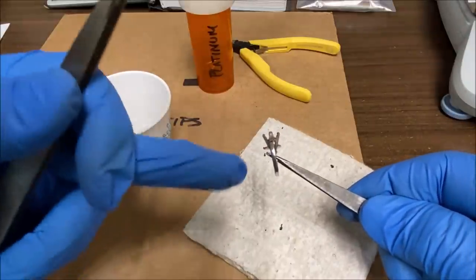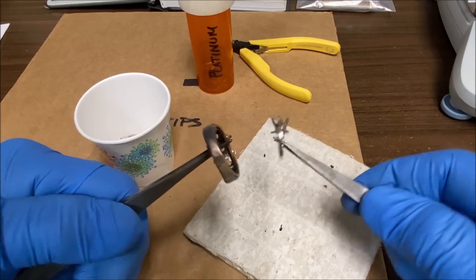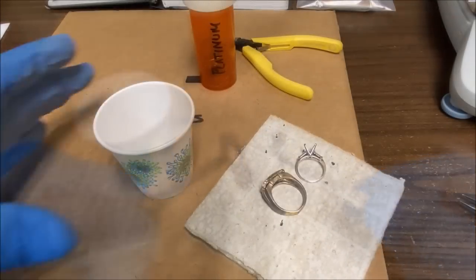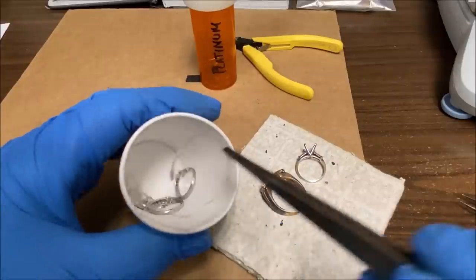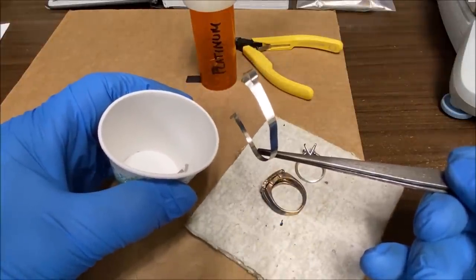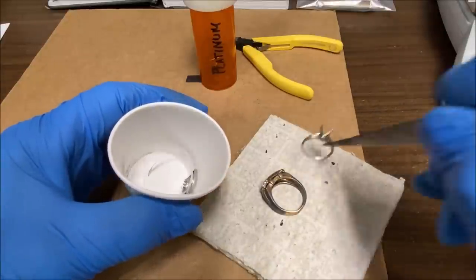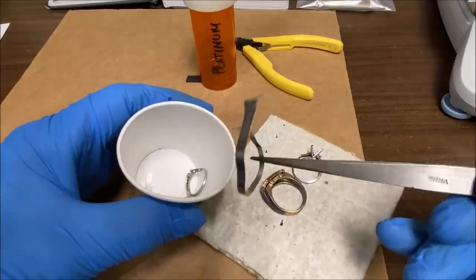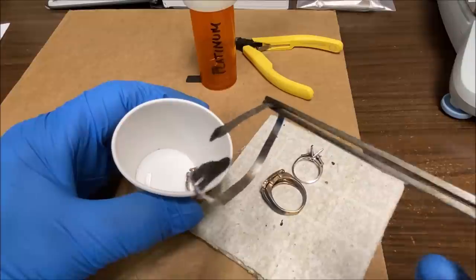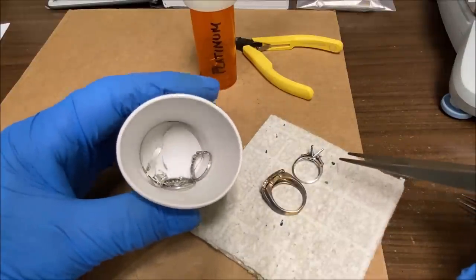This is the ring that we heated up. You can't even tell a flame has been on it. Before we get started, what I'll do is I've got a rolling machine, and I'll take the metal, the rings that are like this, and I'll put them through the roller so that they look like this, flatten them out, get them as skinny as I can in order for the aqua regia to be able to dissolve that metal.